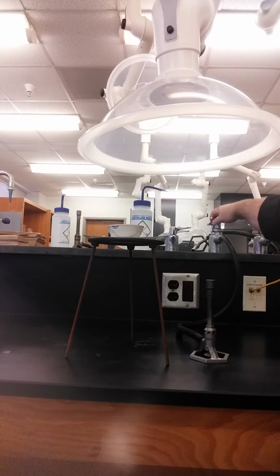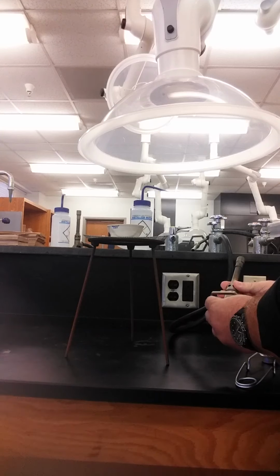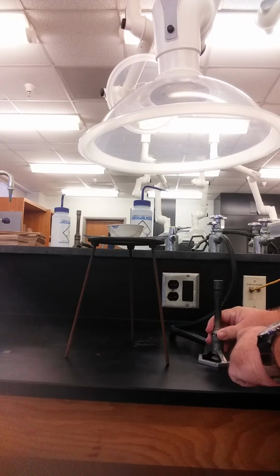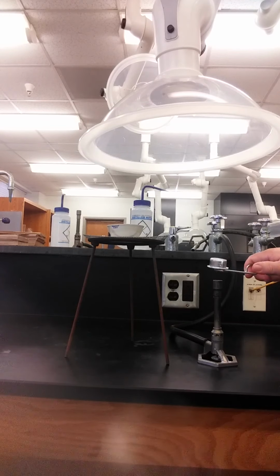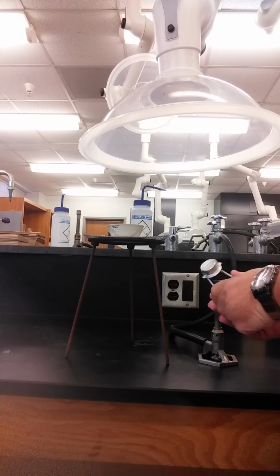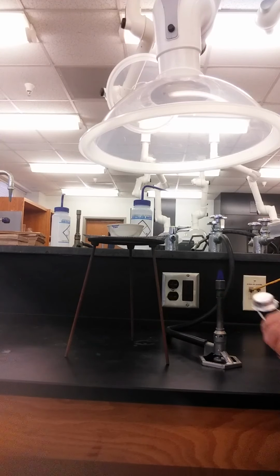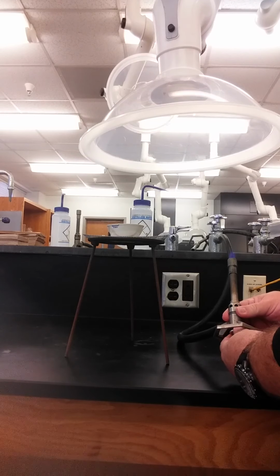First, you must open the gas valve completely by turning it counterclockwise until it stops. Next, make sure that the gas flow valve at the bottom of the burner is open about 2 full turns. Using the striker, ignite the burner. This may not happen on the first attempt. If necessary, open the gas flow valve a little bit more and try again.